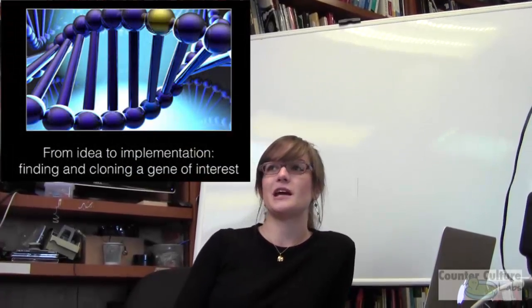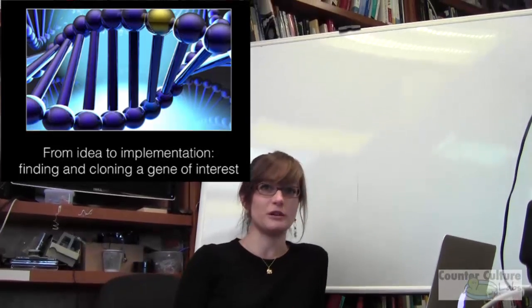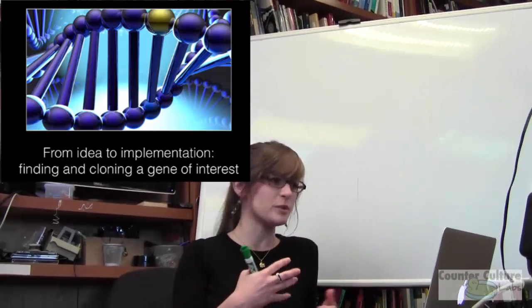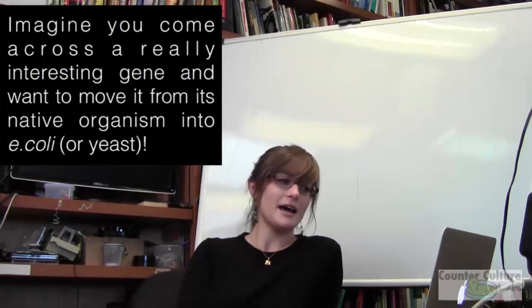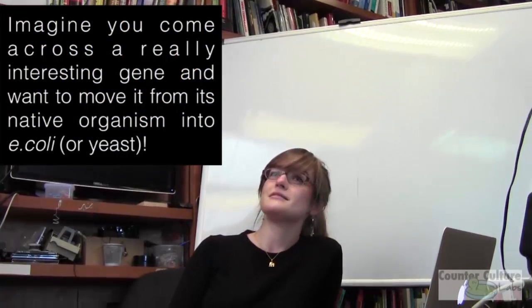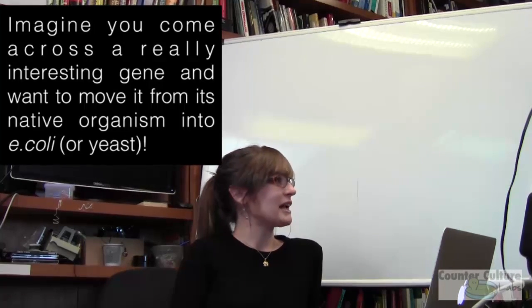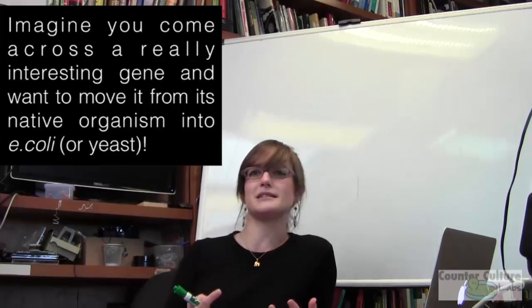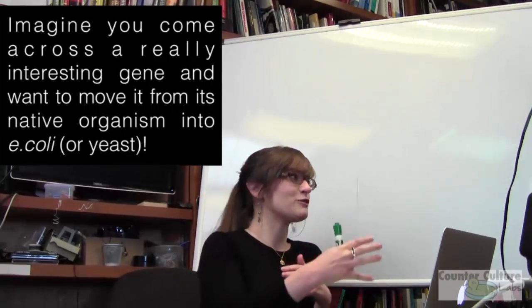I'm going to talk to you today about how you would move a gene from one organism to another, and what the tools are that are available. This should empower you to explore those tools and come up with some of your own ideas that you can talk about in the future. So let's say you came across a really interesting gene, and it has some function. Maybe it participates in a metabolic pathway that creates your favorite small molecule.